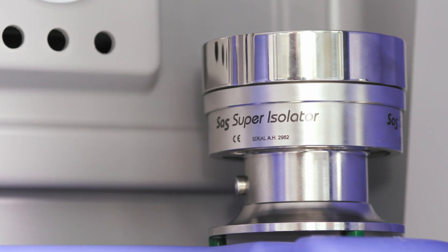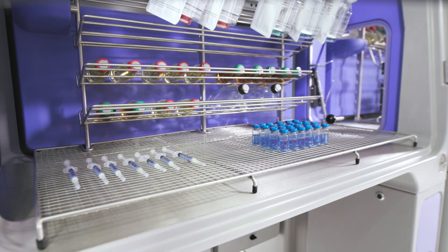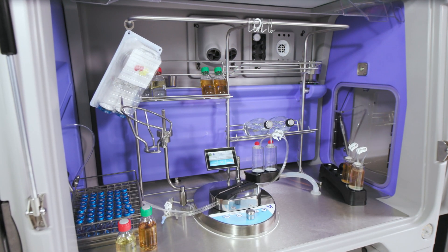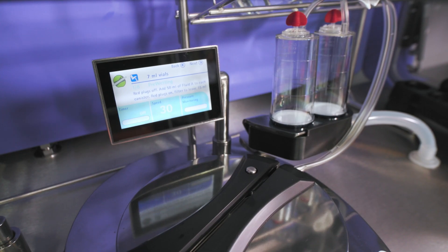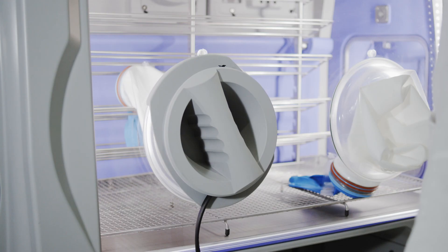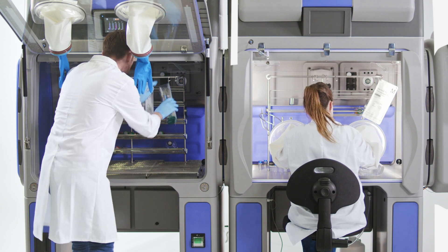Four options of environmental monitoring to suit your needs. Complete racking solutions for various load configurations of supplies. Rapid transfer port. Integrated screen and camera for recording and displaying worksheets. An easy to use glove integrity test system. And safe sort prescription towers.